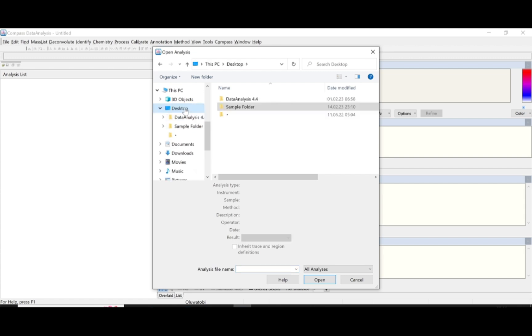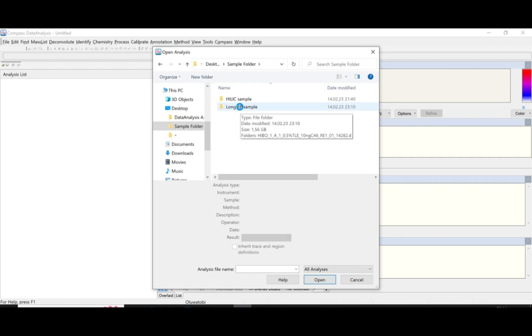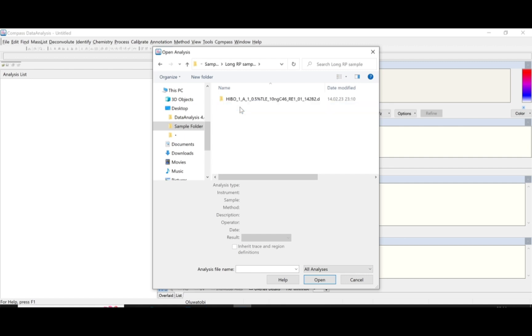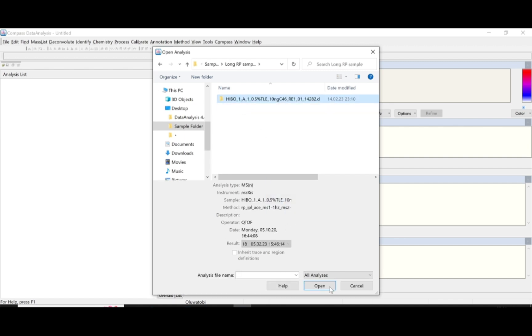You locate the folder under which your data has been stored. My data is under my desktop folder and I have the sample folder as well. I'm looking at the Longalpy method today — samples have been analyzed in the Longalpy method. I click and click on Open.